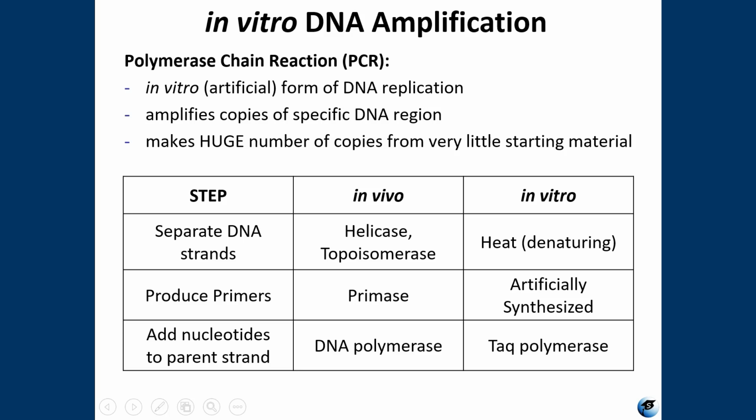Most methods of DNA analysis require a large amount of DNA. The polymerase chain reaction is used to rapidly amplify DNA for use in other molecular analysis. PCR is an in vitro laboratory artificial technique, and it takes advantage of the natural processes of DNA replication. The heat-stable DNA polymerase enzymes used in PCR are derived from hyperthermophilic prokaryotes. The Taq DNA polymerase is derived from Thermus aquaticus.